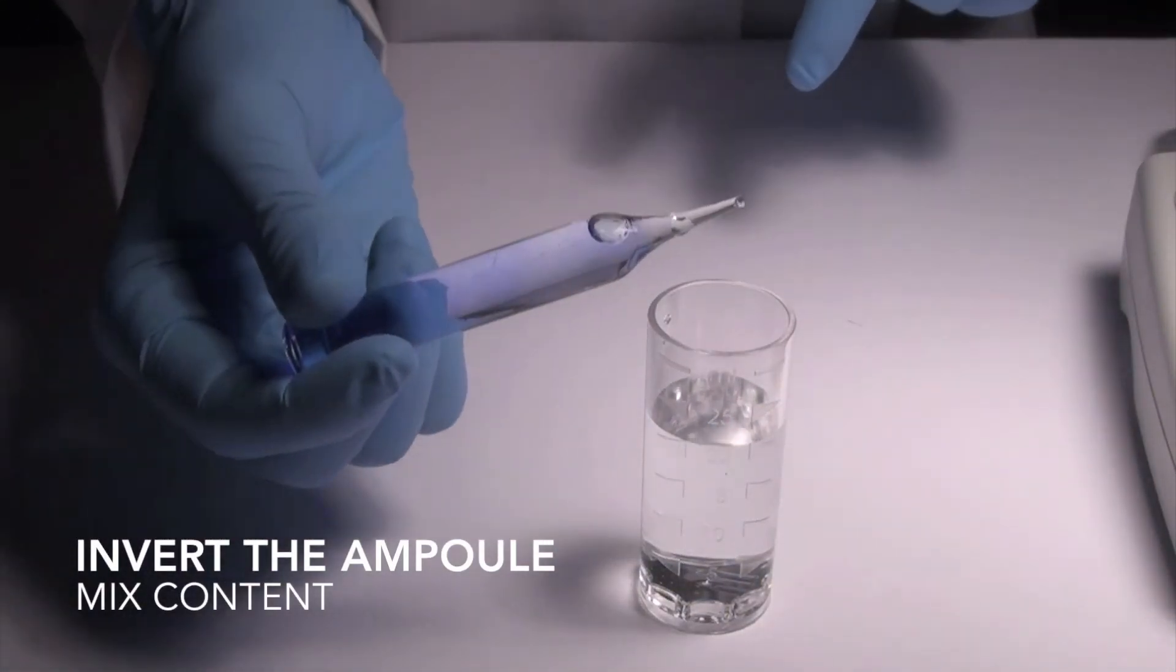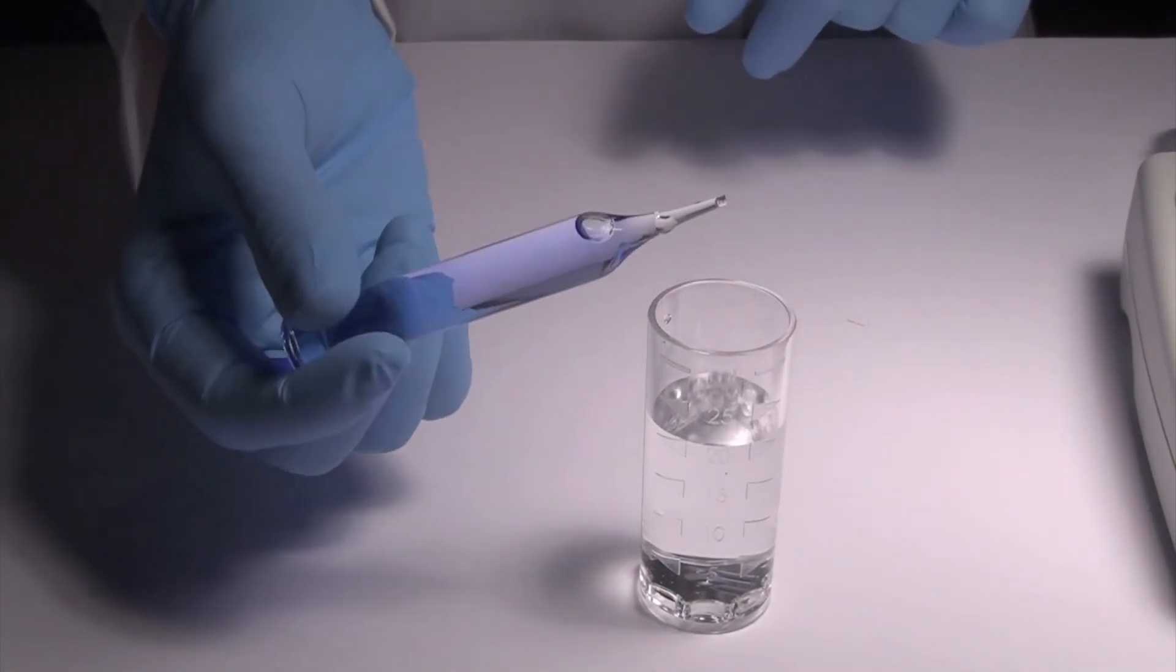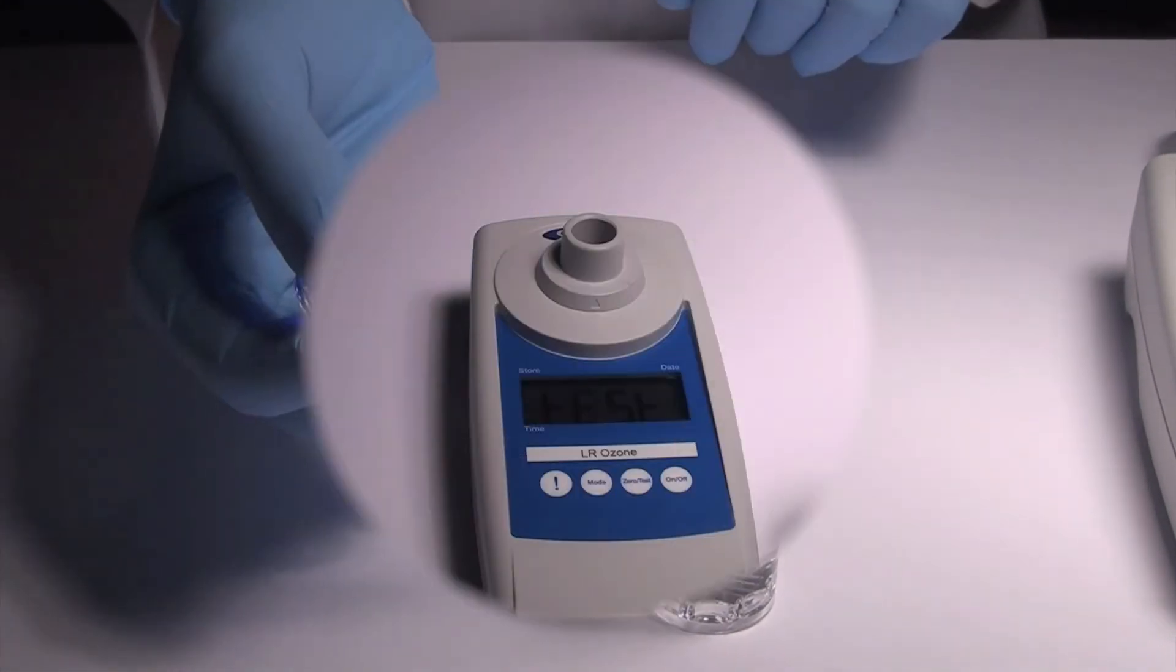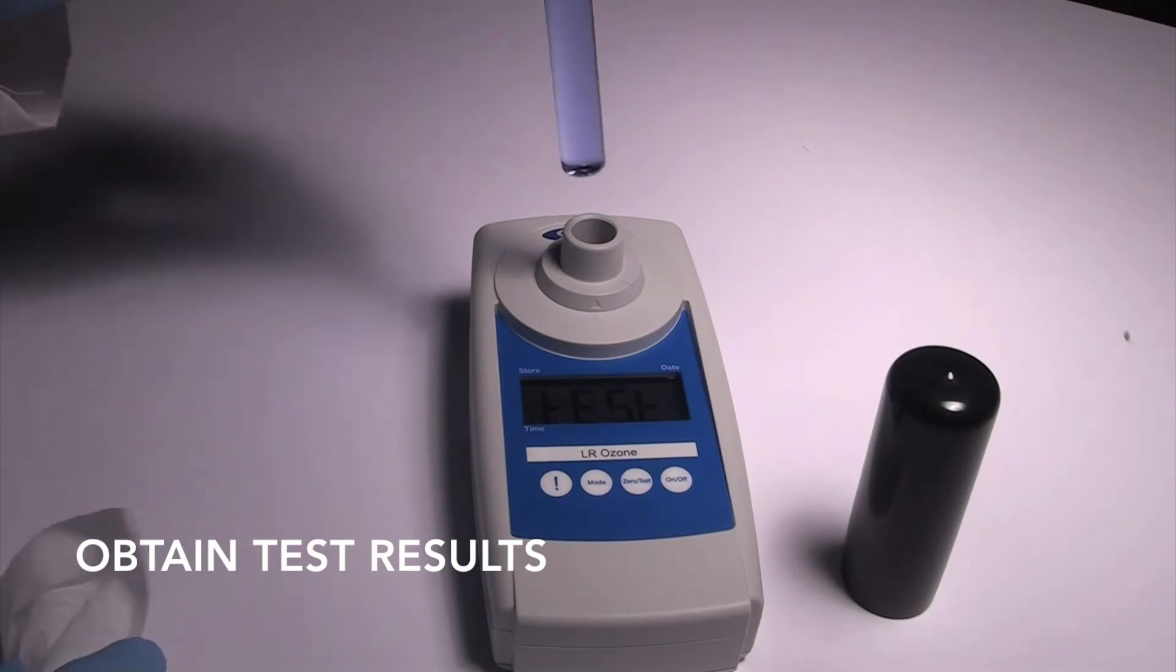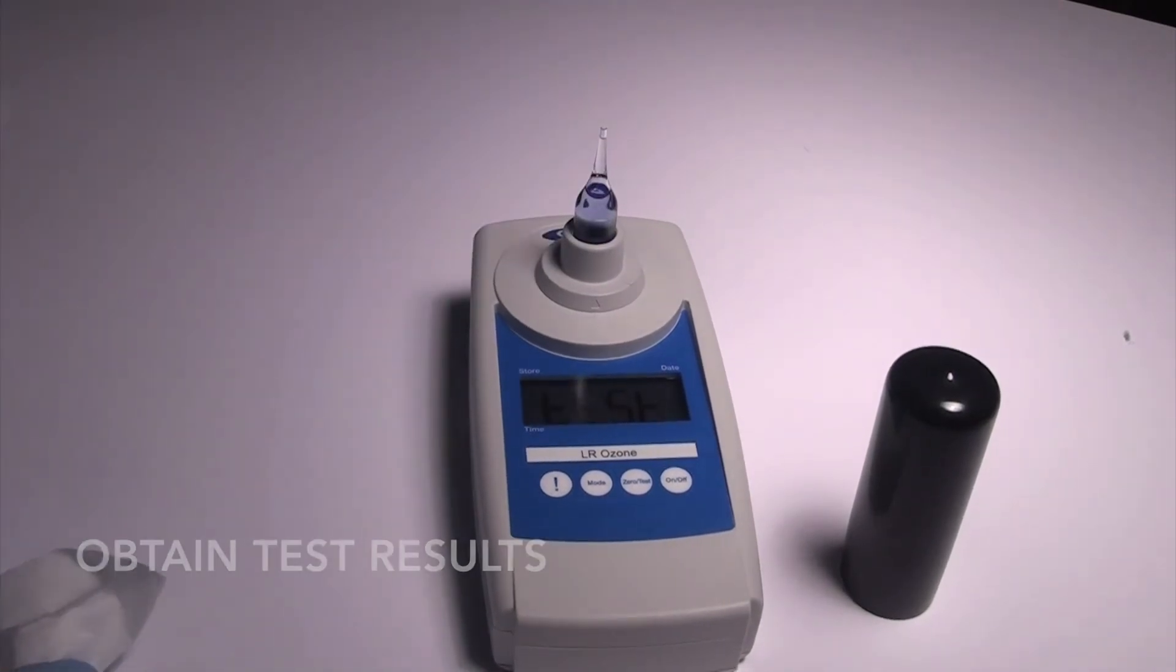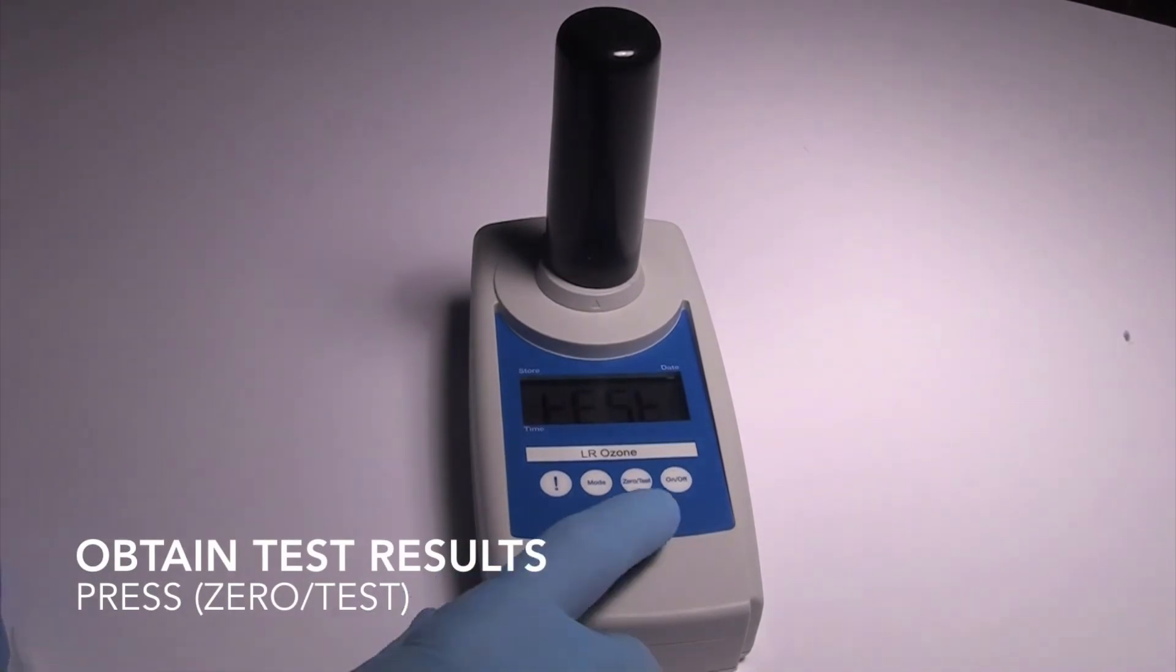Gently invert the ampoule continuously for 30 seconds, allowing the bubble to travel from end to end. Dry the ampoule and insert it into the photometer, flat end first. Place the light shield over the ampoule and press zero test. The SAM photometer will display a test result in parts per million ozone.